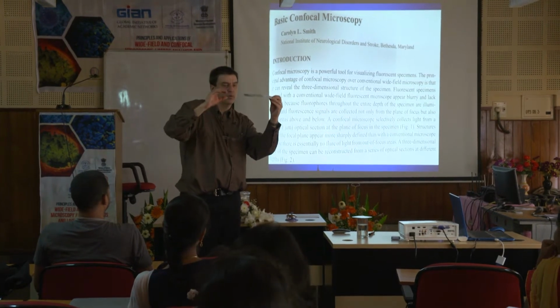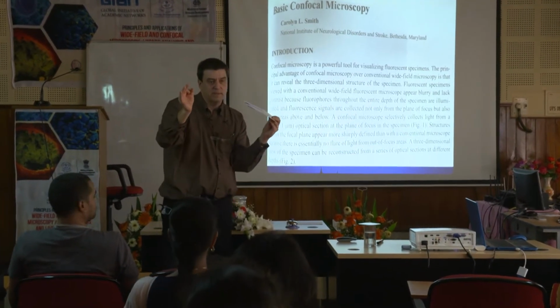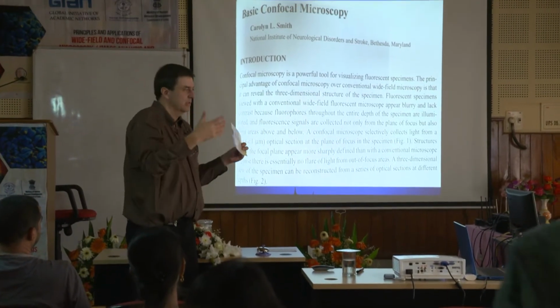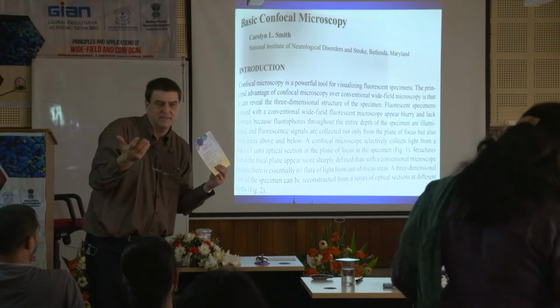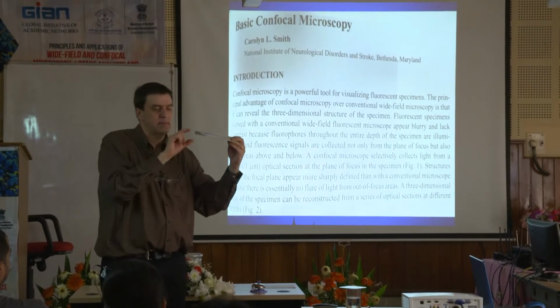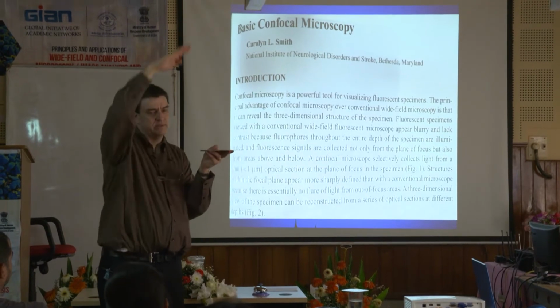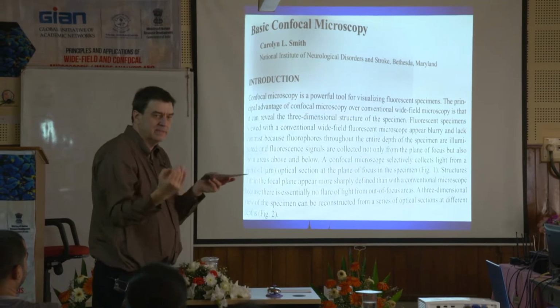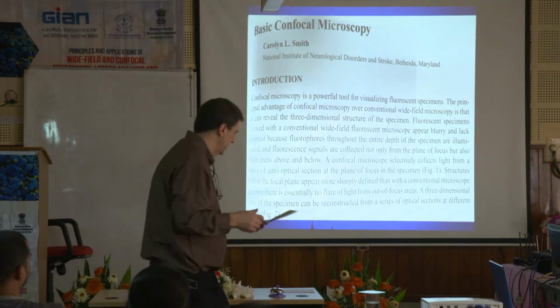But with the confocal, by the use of a pinhole we talked about yesterday, remember if you go like this, you look through it, things are a little cleaner, a little crisper. They just seem a little better because you're not bringing in all this extra light. Same idea here. You're not bringing in all this extra light that's not in focus. You're just bringing in that thin focal plane. Okay, that is the basis of confocal microscopy.